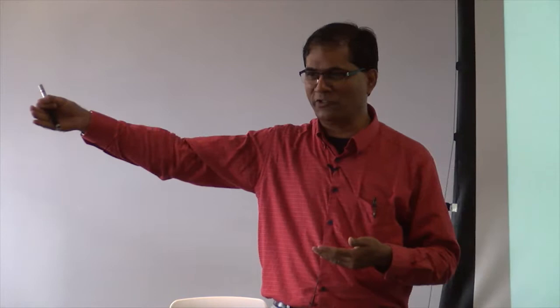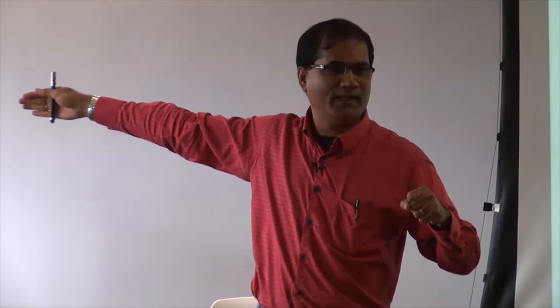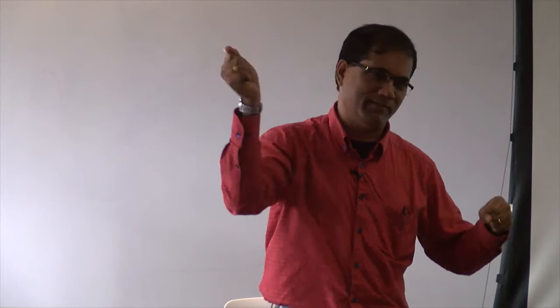Great. Did I convince you that if you make a million-well array, you can sequence a human genome at a cheaper price, faster? Yes? The concept is good. Great. But how to do it? See, the idea is great. First, get the idea. Get a big idea, don't be scared of having a big idea, and then start executing it. How do we do that?